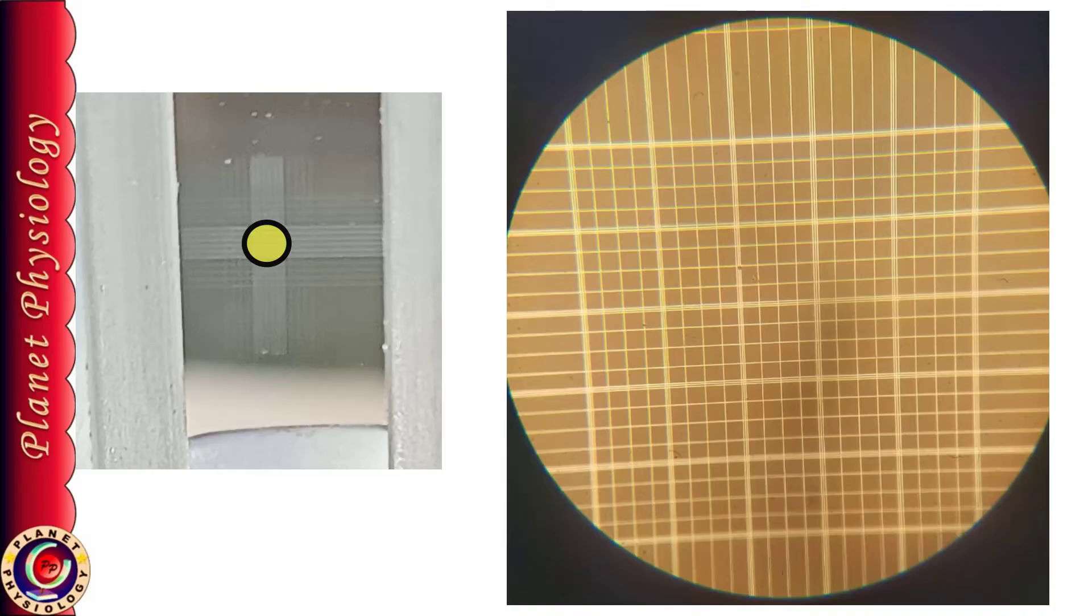So you have to adjust the stage in such a way that entire RBC square is visible. How you can make it sure? You can see 25 medium size boxes bounded by triple lines. This makes sure that you are in the central RBC square.